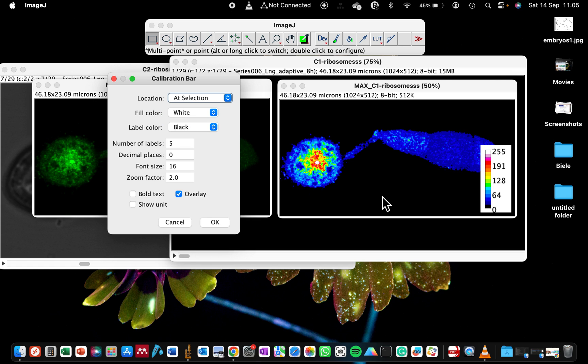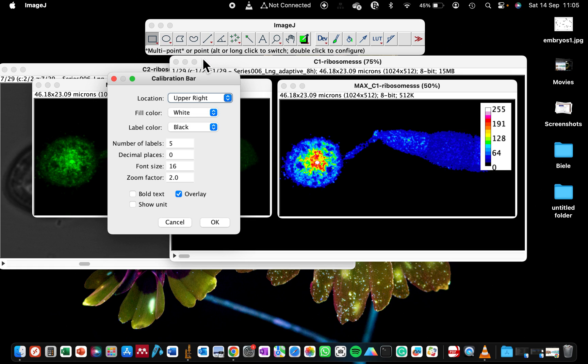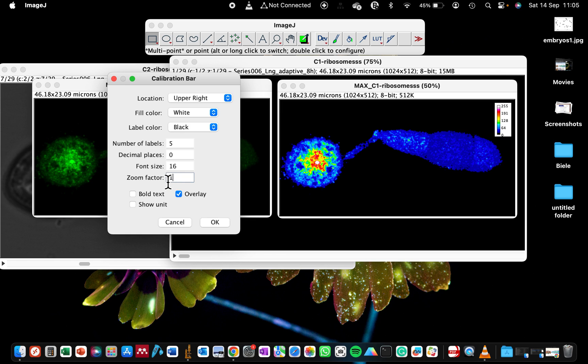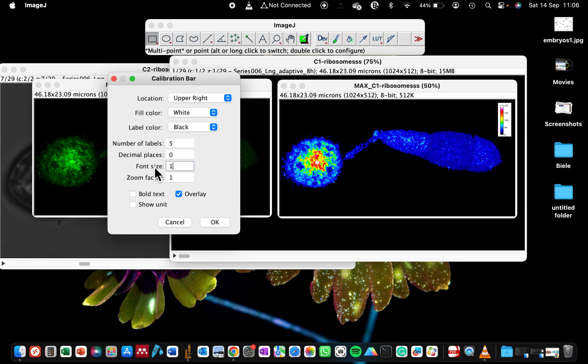You can even decide if you want it at a particular selection, just draw there and it will be there. You can make it a separate image. In the upper right you can see it's obstructing our image, so we can reduce its size by changing the zoom factor to be one. You can even make it 1.5, but it's still obstructing our image, so I'll leave it at one. You can decide on the font size; by default it will be 12. You can decide on the size you want to make it readable. You can see that 20 is doing a good job.